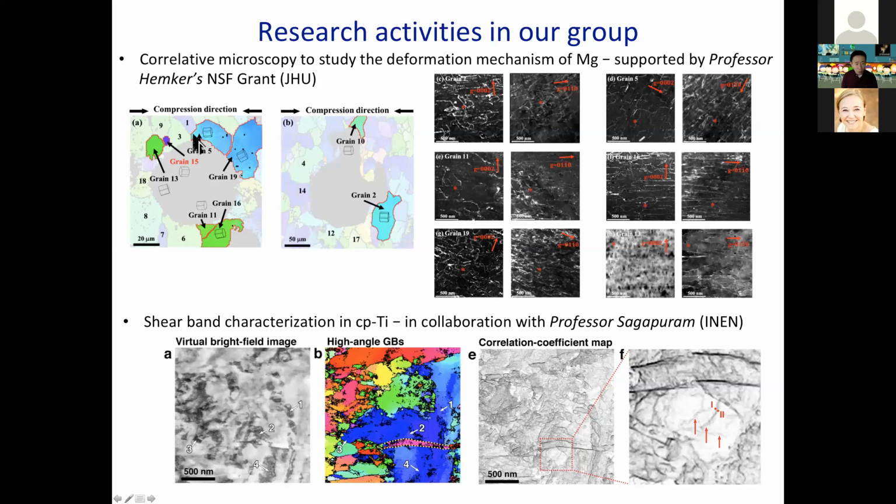Then De Xing electropolished the material. The center black or dark region is actually a hole, so there's nothing here. Around this perforation, the material is electron transparent. In these areas, we can do TEM and really resolve the defect structures to tell us what kind of deformation mechanisms are activated. In this case, we'll have a one-to-one correlation of the deformation mechanism with the Schmid factor and crystal orientation in the material.